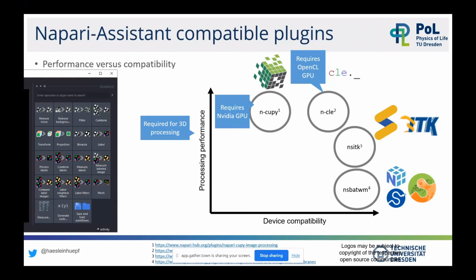I'm saying it that explicitly because I would love to make Napari plugins which run everywhere, but the effort is super high and it may not even be possible in general. So if you face a three-dimensional image processing problem, segmenting cells in 3D, buy a proper workstation with a graphics card, and then you may have a much easier life, because then these things are compatible.